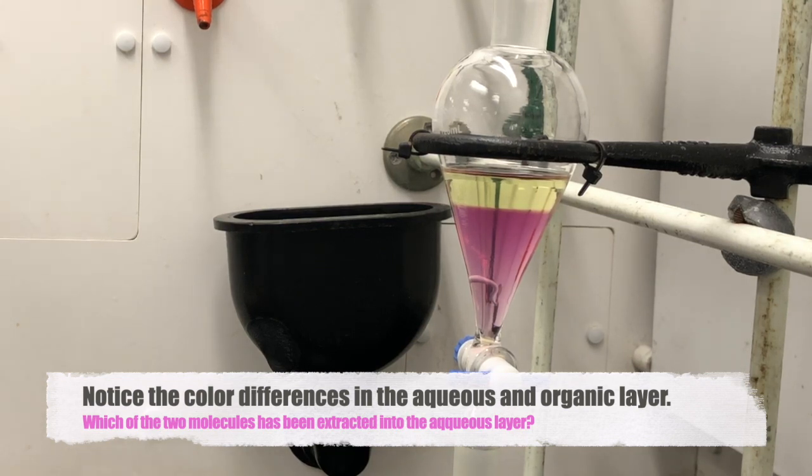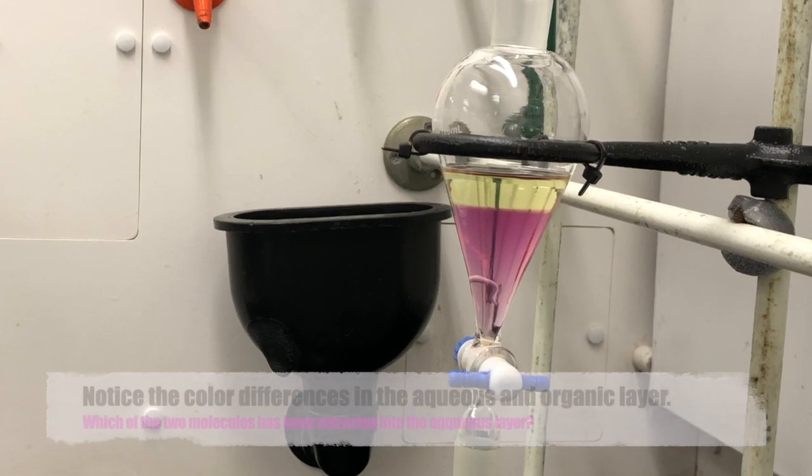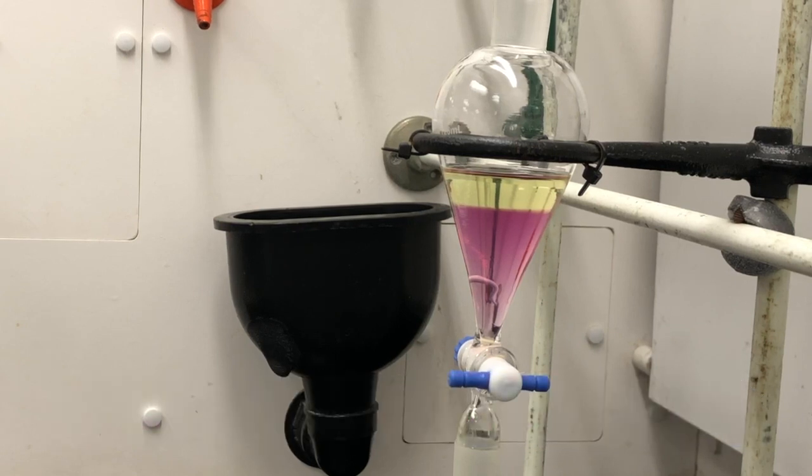And again, if you're not sure which one is the aqueous or organic layer, you can think about it in terms of density by looking up the density of each ahead of time. Or if you're not certain, that's why we save what we collect in case we dispense the wrong layer.